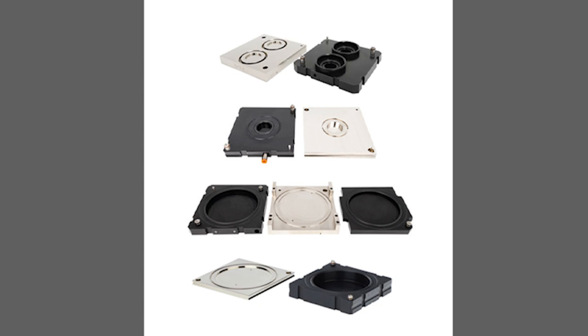In different instruments, some of our instruments can test 4 films at a time. It's still a cartridge system, but we double stack the materials. So you'd have the sample, this would go on top of it, the next sample goes on there, then this comes on top of it. It all sandwiches together, almost like a really good burger, or a turkey sandwich or the like. So this would be a cartridge for what we call a 4-cell system, so you can test 4 samples at a time.